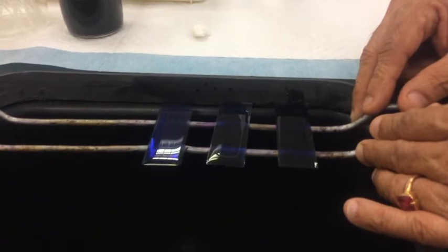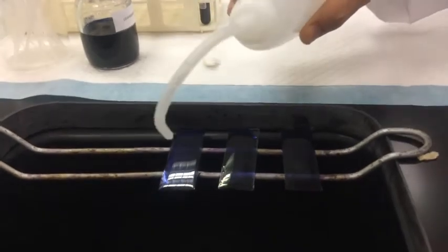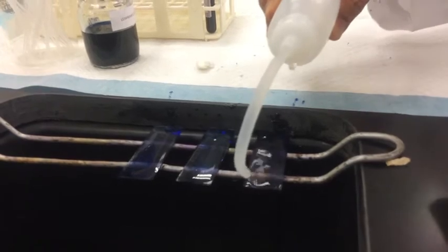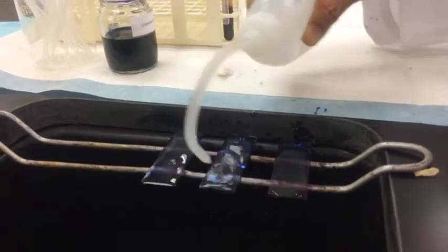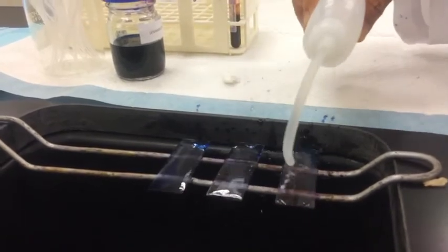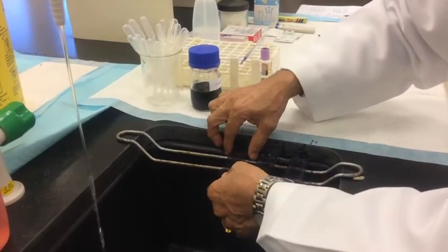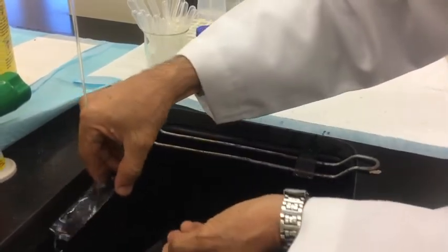When the ten to twelve minutes are over, take the flush bottle and flush out the stain. Do this for all slides, then wash them under running tap water for at least two to three minutes so that excess stain and scum particles are completely removed.